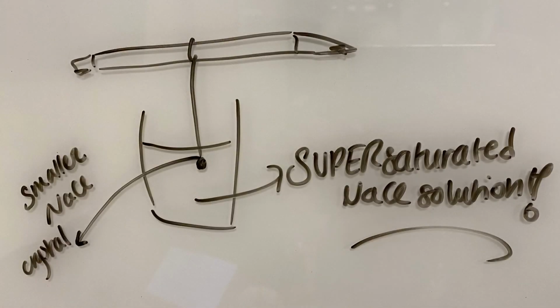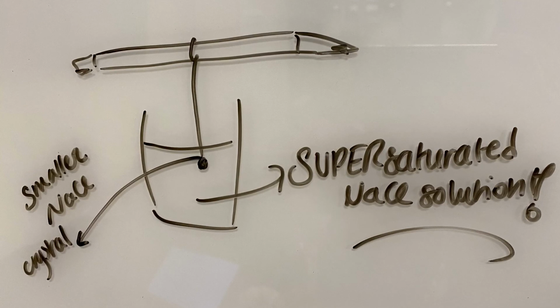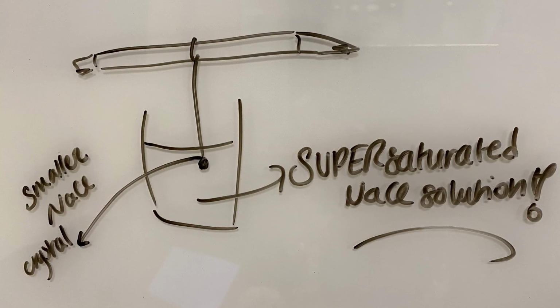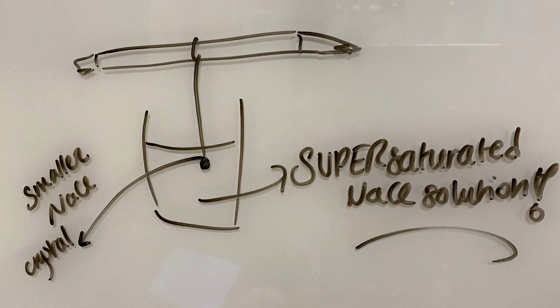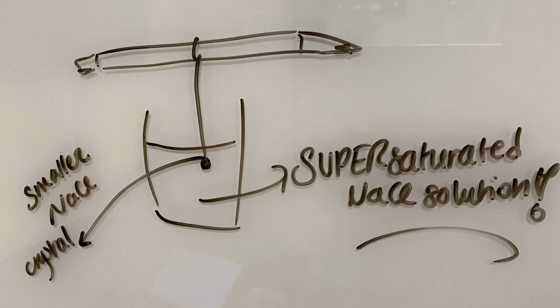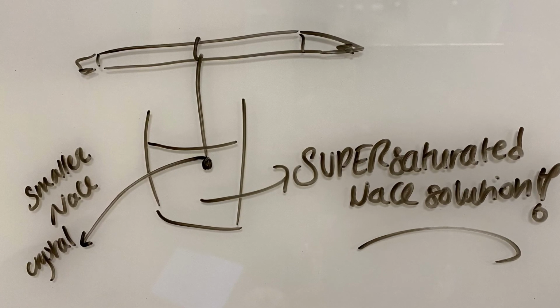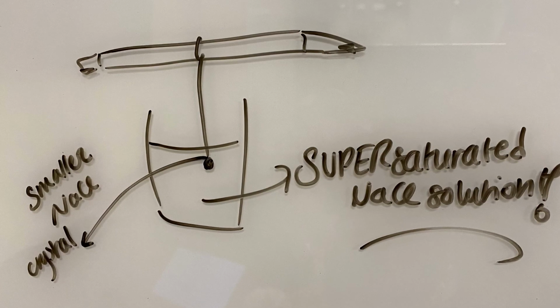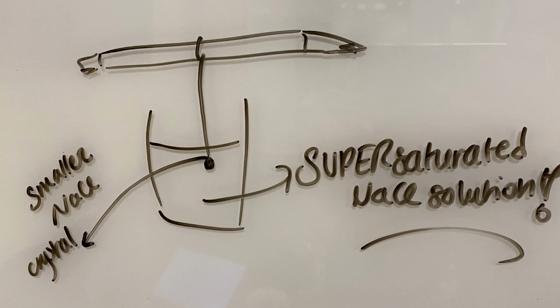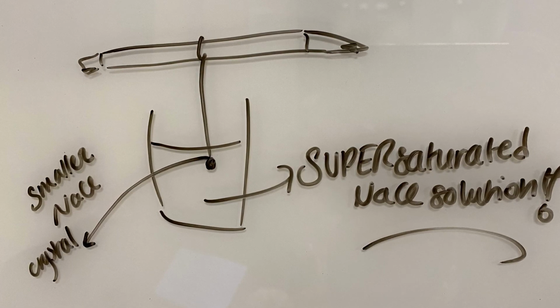To form a larger, more geometrically perfect crystal, there is another method. Form a supersaturated solution of dissolved NaCl and water into a watch glass. As the water evaporates, collect one of the smaller formed crystals and attach it to a string that can be held above a beaker with a supersaturated solution of NaCl. It is important for the solution to be supersaturated so that the crystal does not dissolve and NaCl clumps on the sides of the crystal. With time, a larger crystal will start growing.